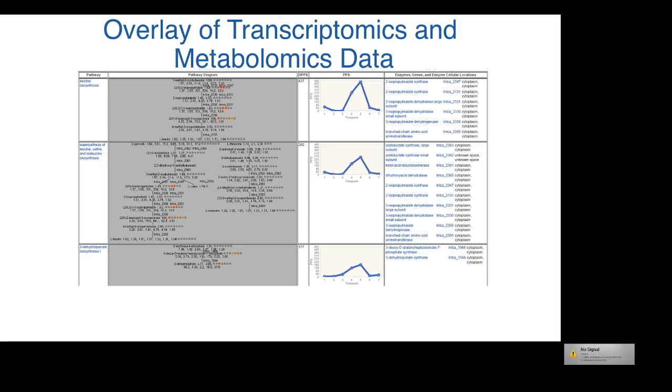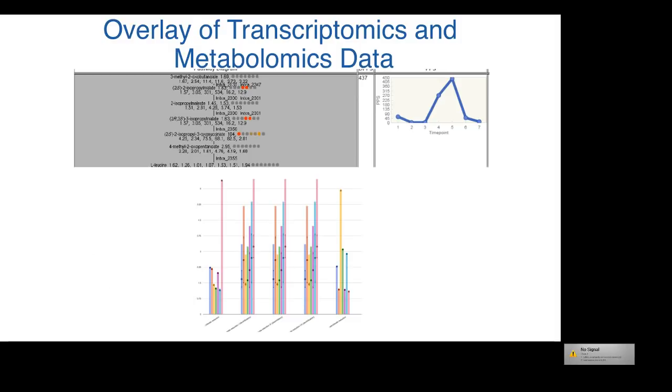This is a very busy one. This is just to say that, not in our XCMS Systems Biology portal, but as a way of validating our findings, my collaborators at the Institute for Systems Biology in BioCyc itself took the transcriptomics data to pull pathways, instead of what we do where we take the metabolomics data to pull pathways, and then they overlaid my metabolomics results onto those transcriptomics-pulled pathways.